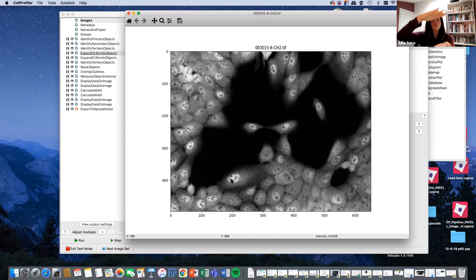We also know that a region which is thicker is just going to have more molecules in it. So even if it is in focus, that focal plane is not infinitely thin. It's going to be anywhere from 0.5 microns up to a few microns, depending on your objective lens and your level of magnification, and whether it's confocal or epifluorescent. So you're seeing some sort of fat slice in the Z dimension through the cell of photons that you're gathering. Of course, a thicker section is going to have more molecules in it than a thinner section, which is going to be partly cell and partly just the medium.